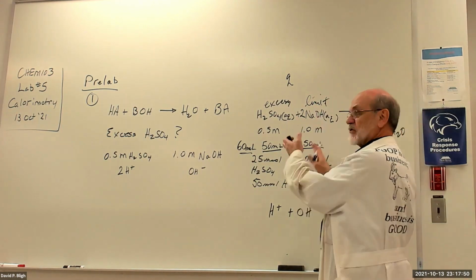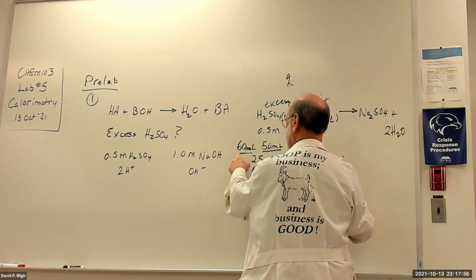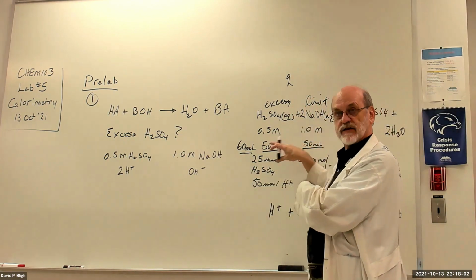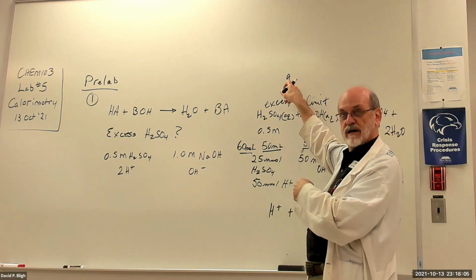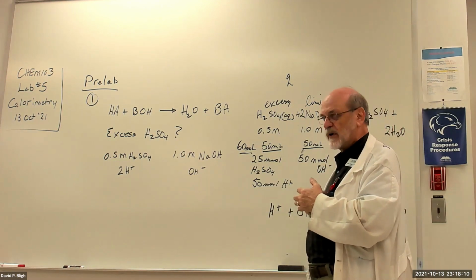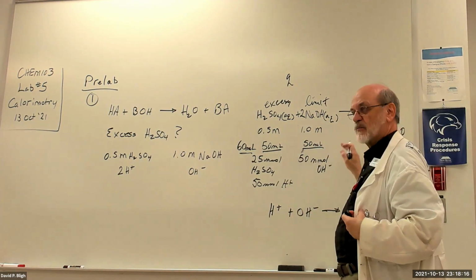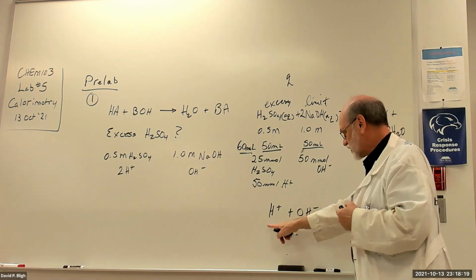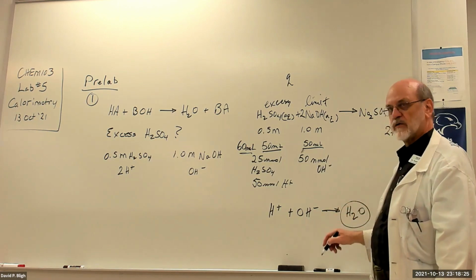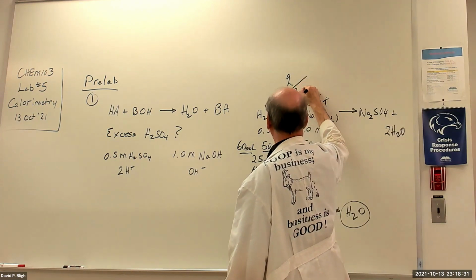it will depend on how much is reacting. Right? If we put 100 milliliters here and 110 here, we get a complete reaction, but there'd be more reacting acids and bases. So that value would be higher. And that's an extensive property. We need an intensive property, one that will not change with amount. So we reference it to one of these reactants or products. And the best way to do it is to use this net ion equation and reference it to the moles of water produced. So that's why when you get this Q, then you divide it by the moles of water.